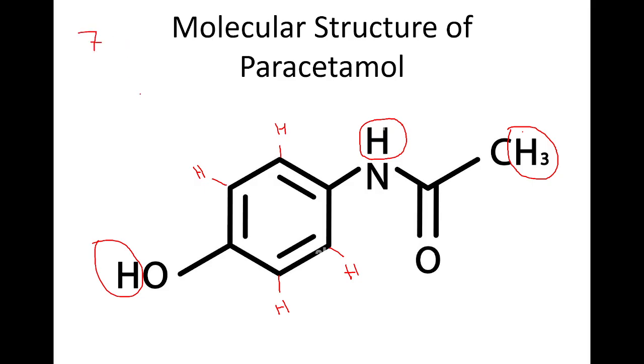But how many NMR hydrogens? What do I mean by NMR hydrogen? Hydrogens, protons that are non-equivalent. This is one of them, one environment. We call it a proton environment. This is one environment, and definitely this is another environment. Why? Because this is completely different from everyone else. This is another environment. We'll leave it for later.